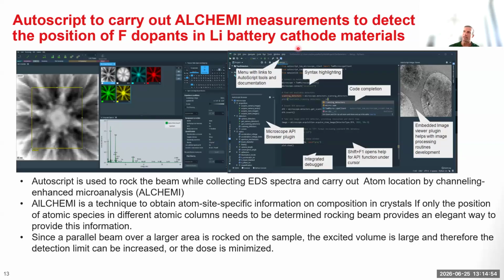And we tried EDS, we tried EELS. Obviously, EDS is impossible in the TEM to see the lithium. We could see lithium in EELS, but we couldn't map it down to the atomic level. So we were not able to answer the most important question, which was where the lithium is located.